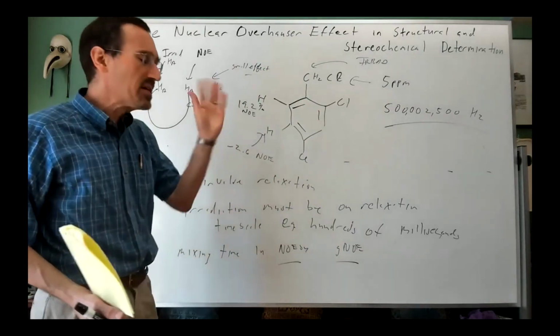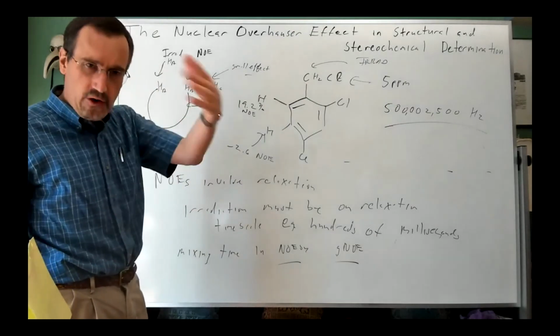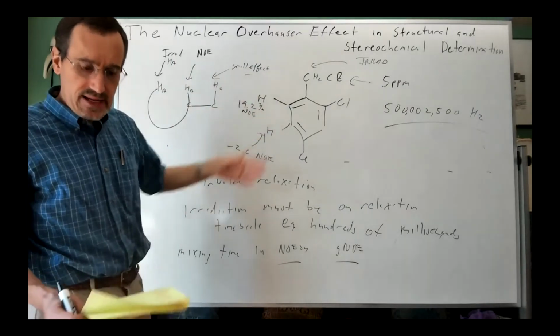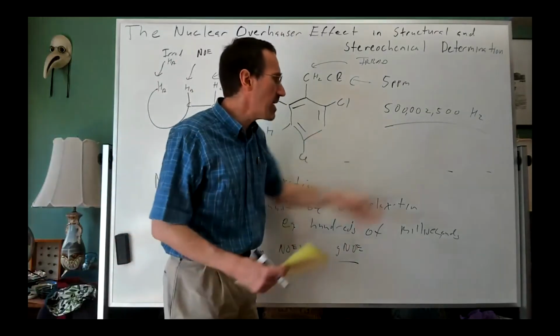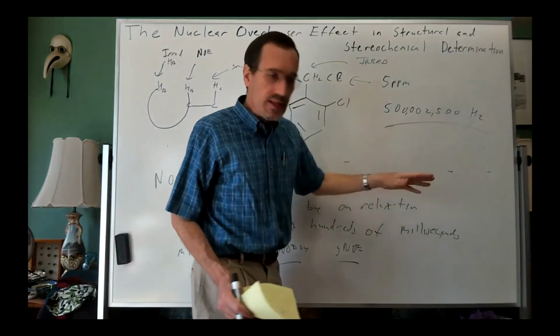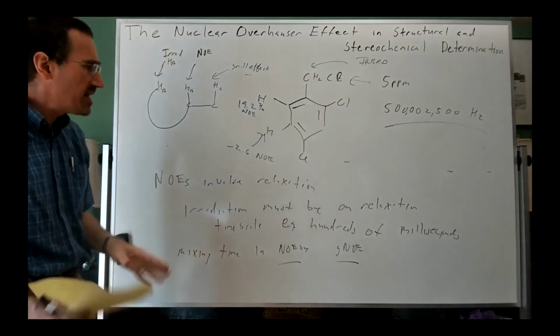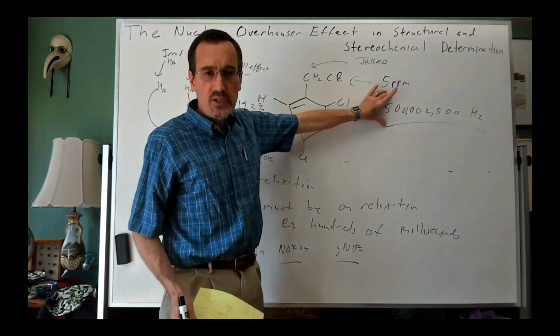I don't even know, maybe it's terahertz, whatever it is. You don't want to be using your cell phone that's at the same wavelength as the pilot's. So it's the same thing here. We're basically hitting with a relatively selective frequency. Now, in the case of the NOESY and the gradient NOE experiments, it's a little bit different than this, but from a point of conceptualization, that's what I mean.